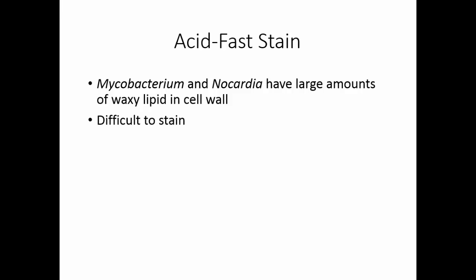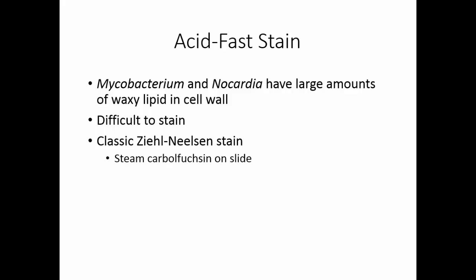But wax is very difficult to stain. So the classic acid-fast stain is called the Ziehl-Neelsen stain. You use a primary stain called carbolfuchsin, but you have to steam this on the slide.